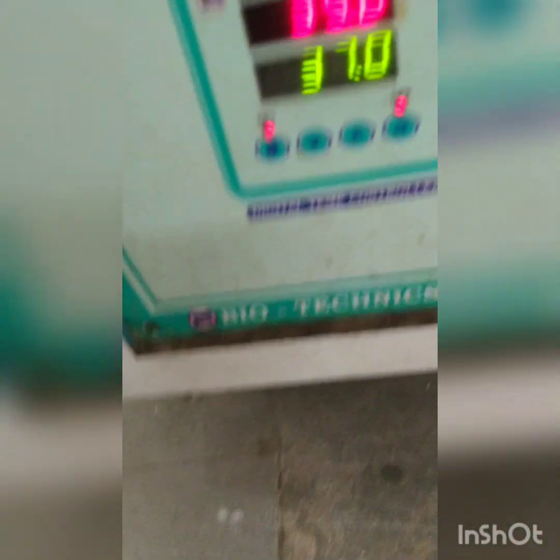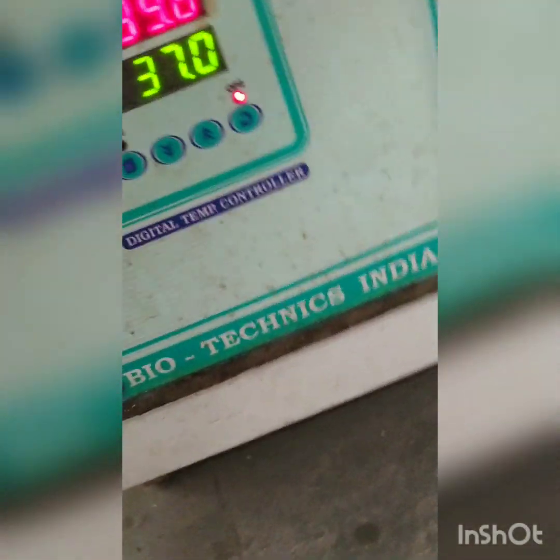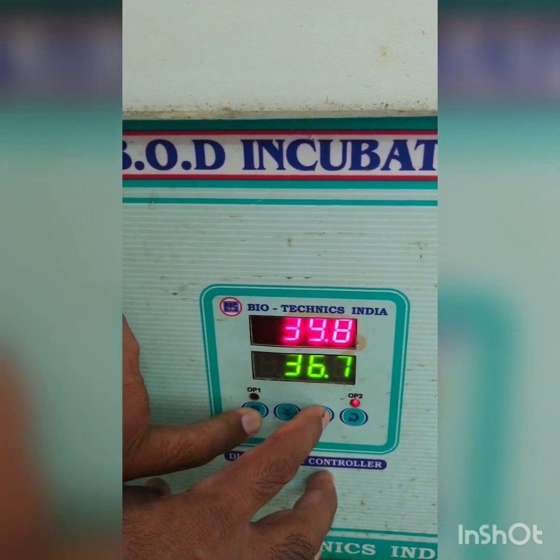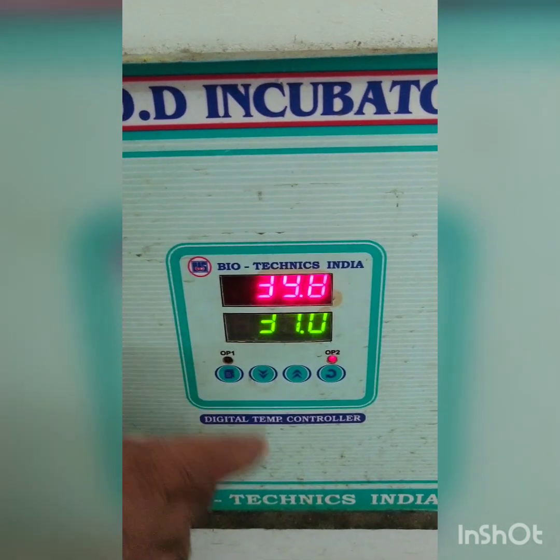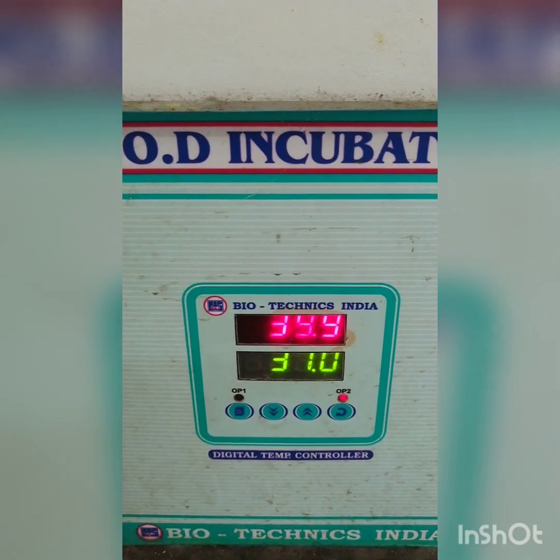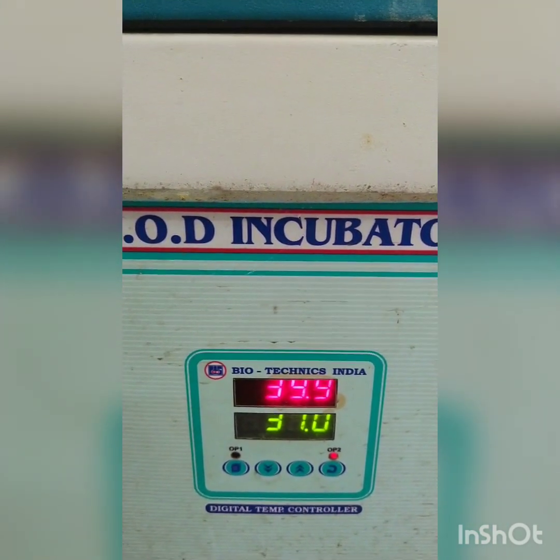Now we have kept the samples in the incubator, which is maintained at 37 degrees Celsius. We adjust the temperature to 37 — currently it is showing a slightly higher temperature but it will come down. We will maintain it for 24 hours. Tomorrow we will see what happens to those tubes, and especially the Durham tube. If they develop gas, it is an indication that bacteria are present. The next part we will see after 24 hours.